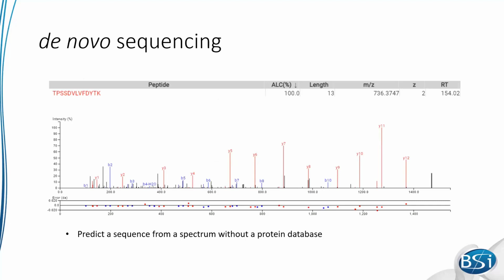But Peaks is able to do this pretty quickly and accurately by looking back from the precursor mass and forward from 0 in both directions simultaneously to try to predict which peaks in the spectrum actually match up to your actual peptide. The end result of this is that you get a spectrum match such as what we see here, where red peaks are matched up to X, Y, or Z ions, and blue peaks are matched up to A, B, or C ions.